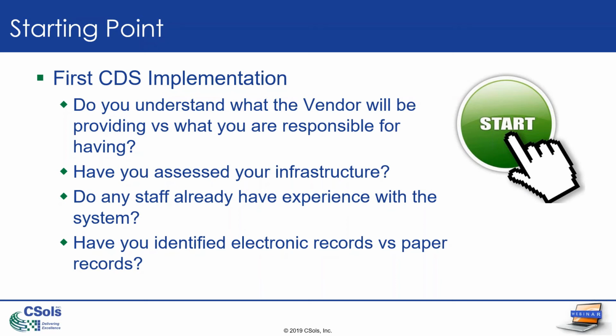And I talked about infrastructure. Another thing to consider is, have you assessed your infrastructure? And what I mean by that is, and I'll touch on it a little bit more when I get to the instrumentation portion of it. But obviously, if you're looking at implementing an enterprise version of a CDS or using it across multiple sites, multiple labs, do you know if you have the infrastructure set up to do that, or do you need to purchase things like server space?